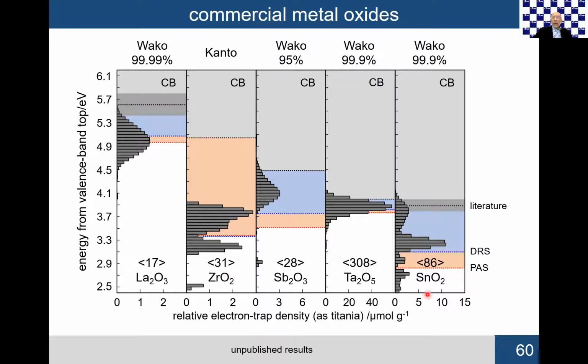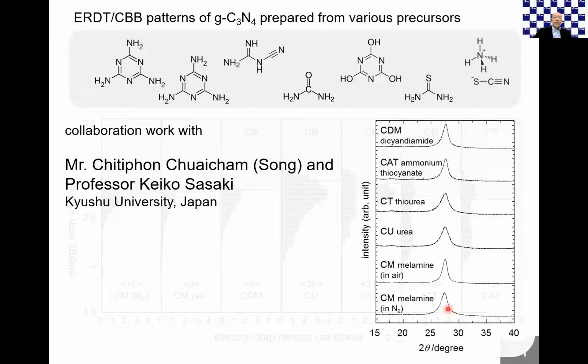And for tin oxide, that is a bit of a complicated structure, and this gives the complicated surface structure of tin oxide. And not limited to metal oxides, carbon nitride, that is also a semiconducting material, those samples can be characterized.